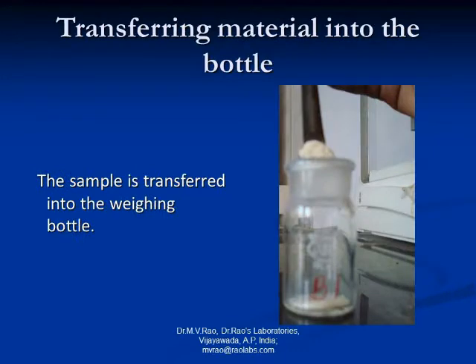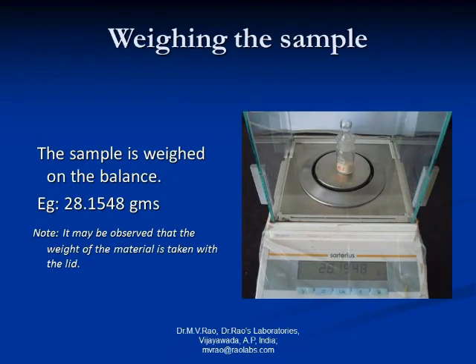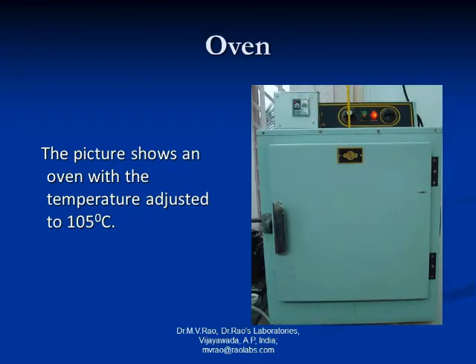The sample is transferred into the weighing bottle carefully with the help of a spatula. With the lid closed, the sample is weighed on the balance. This picture shows an oven with the temperature adjusted to 105 degrees centigrade. Remember, the oven has already attained a temperature of 105 degrees centigrade by the time we start the experiment.